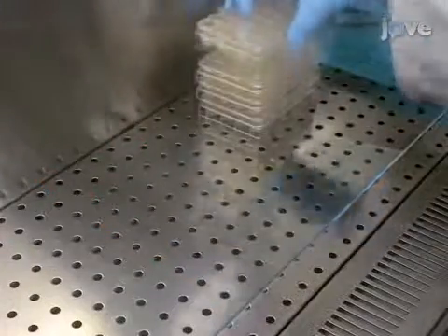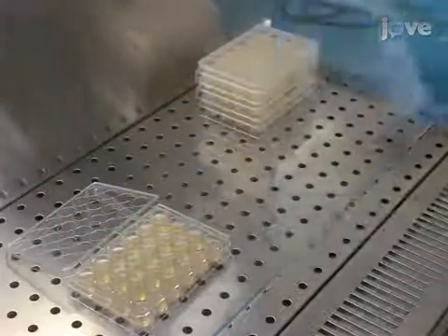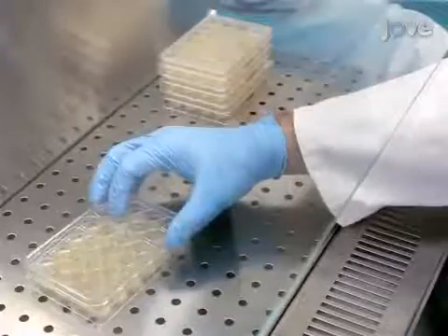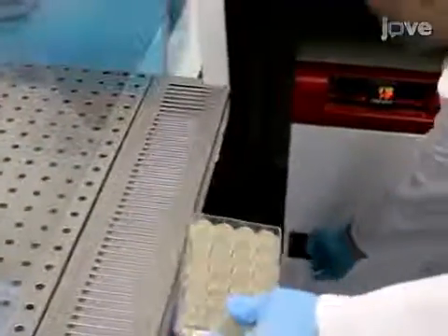Once the precultures are in the incubator, dry the LB agar plates in a hood with their lids off for about 10 minutes. Then invert the plates in a 37-degree Celsius plate incubator overnight.